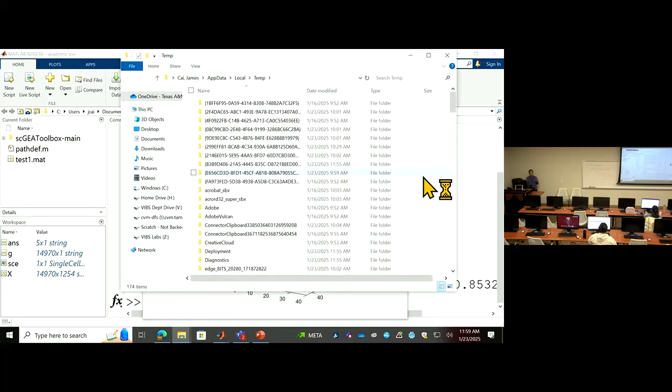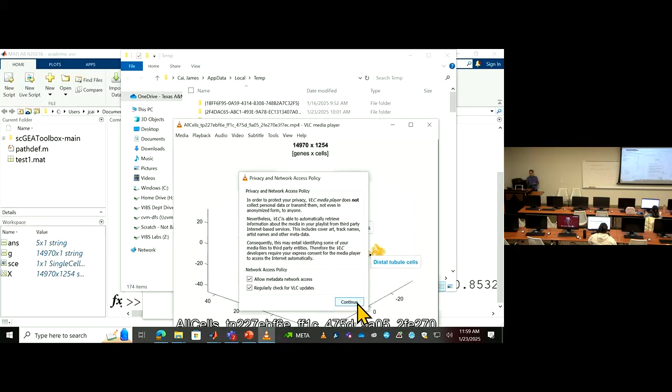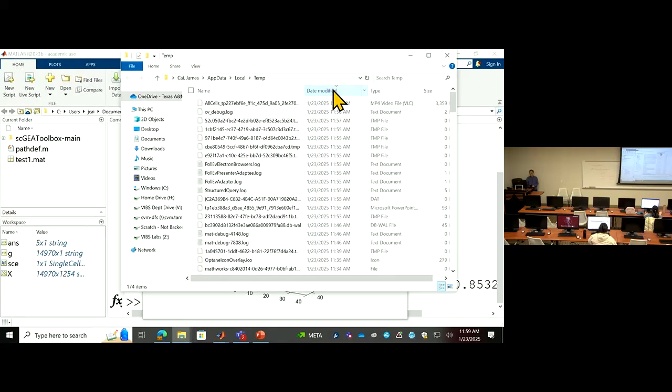Say, okay, this is my preliminary annotation of your cell type. Does this make sense to you? And they will give you feedback, and now you can have a communication with your collaborators with this MP4 file. Okay, so it will be generated in here.